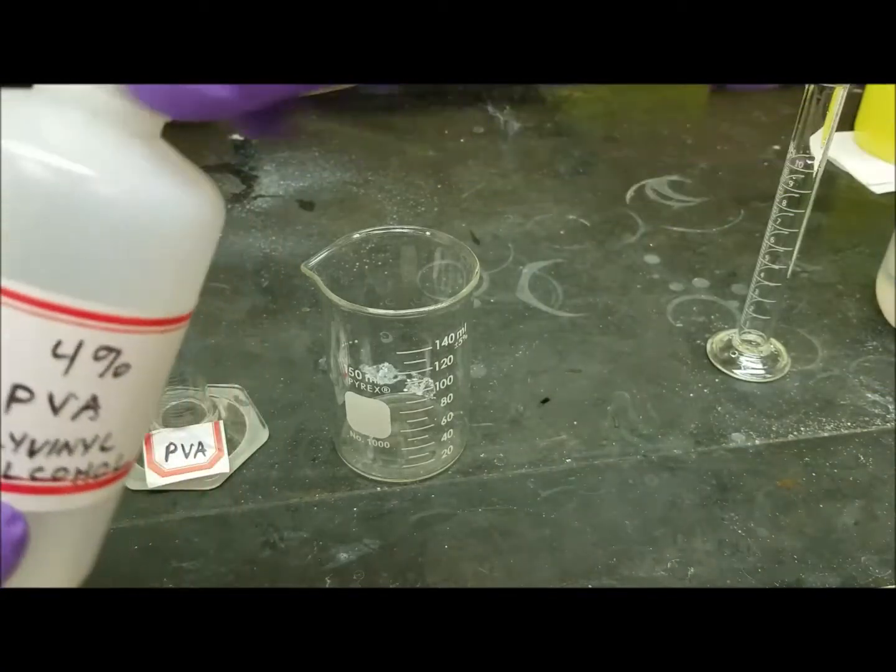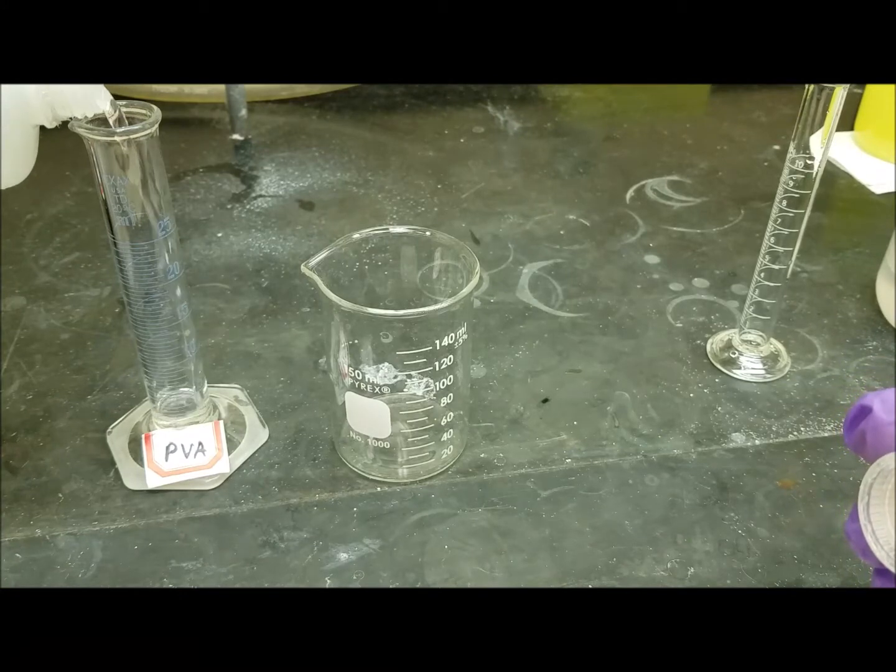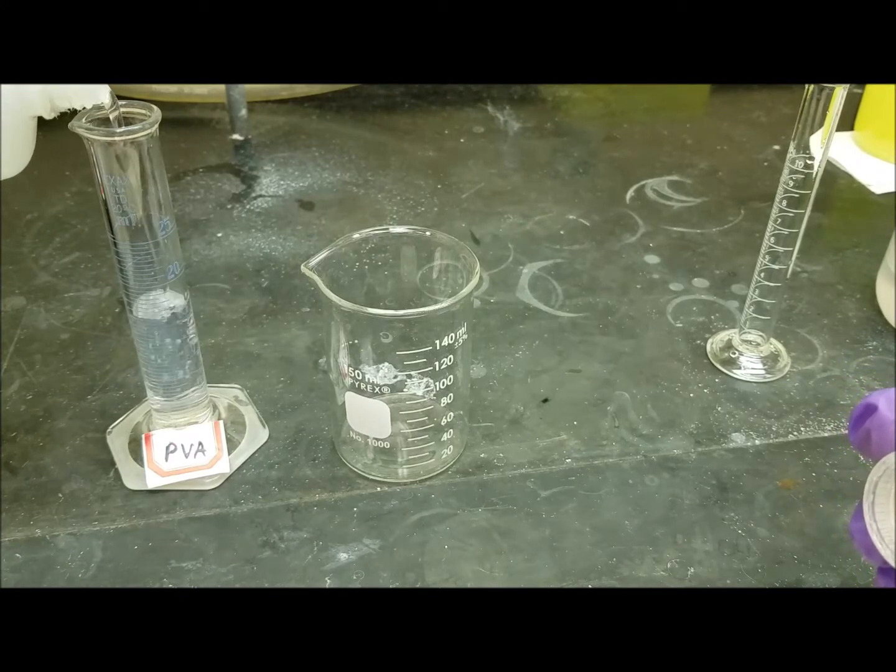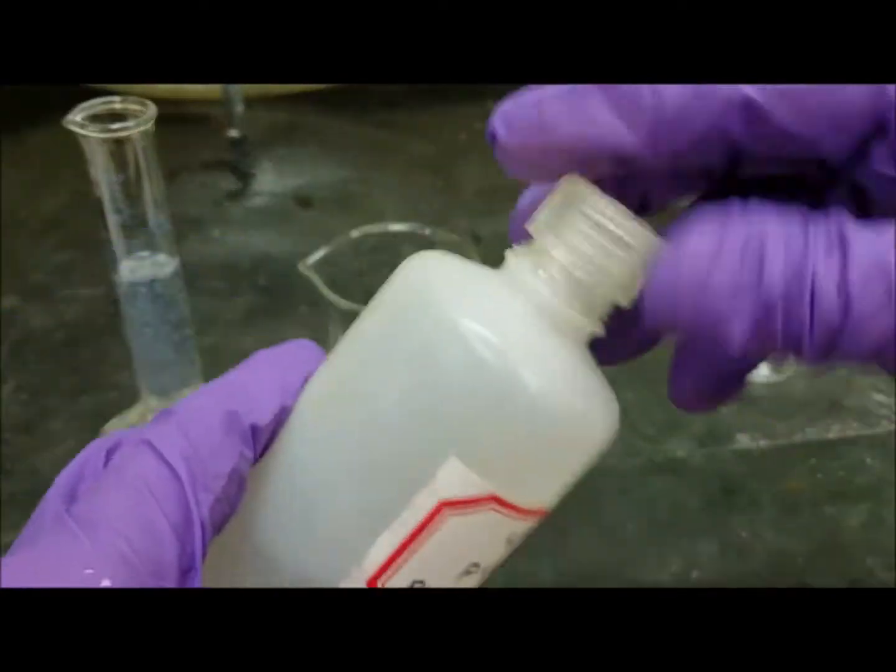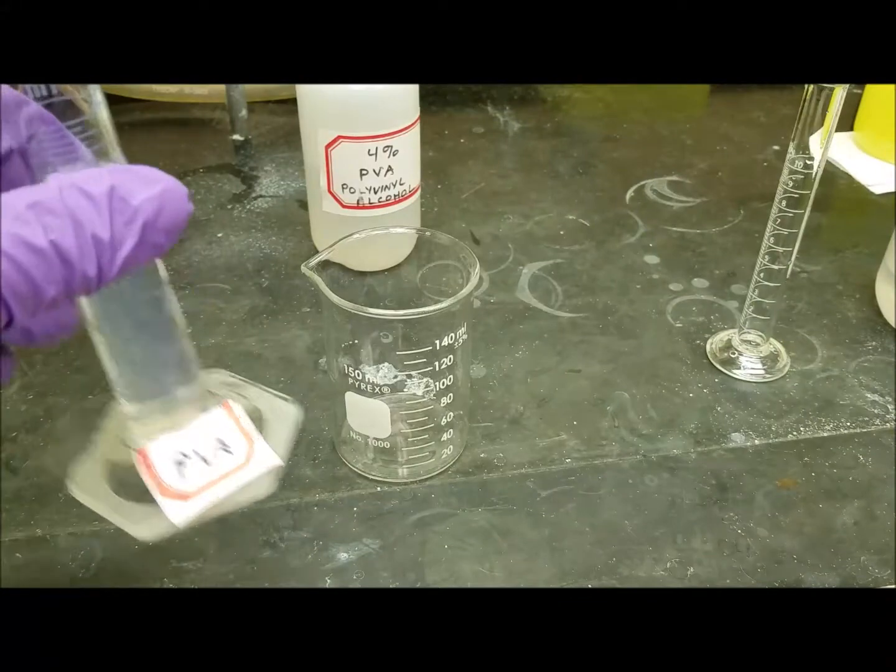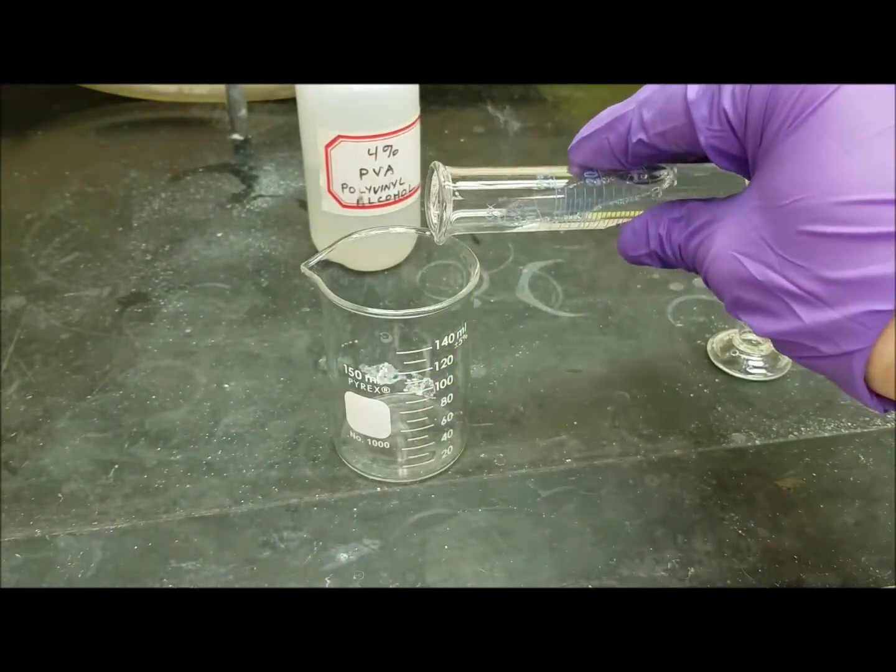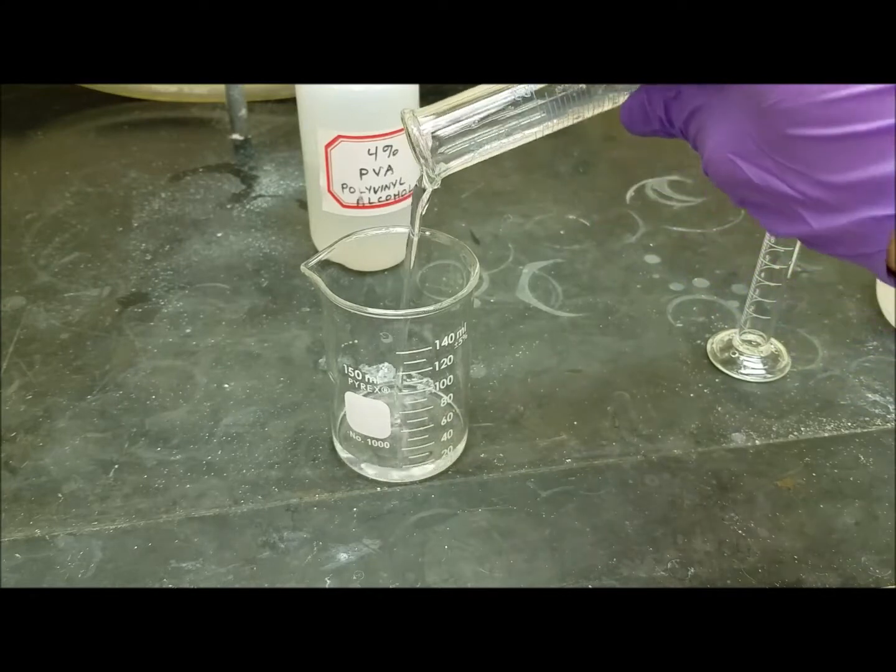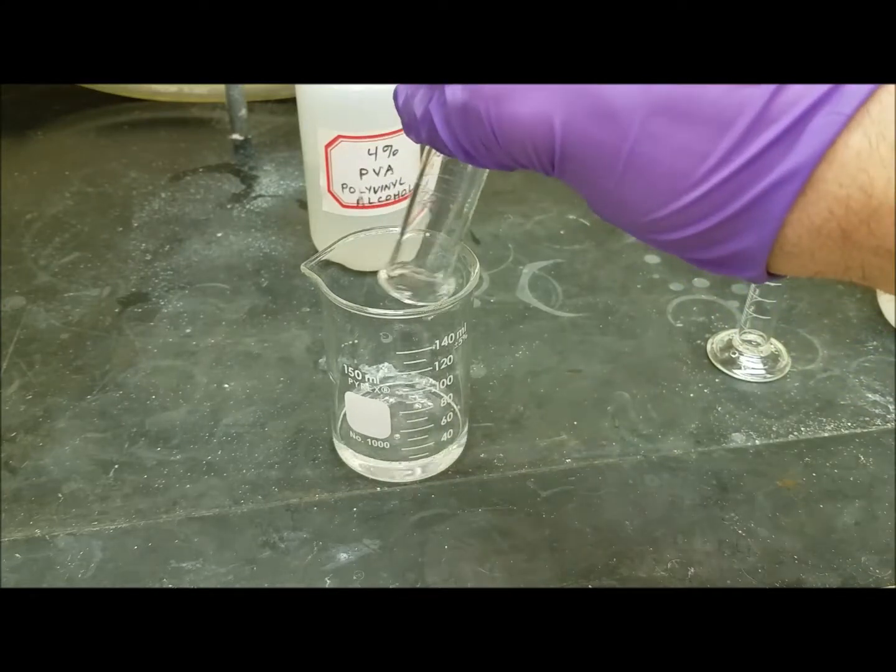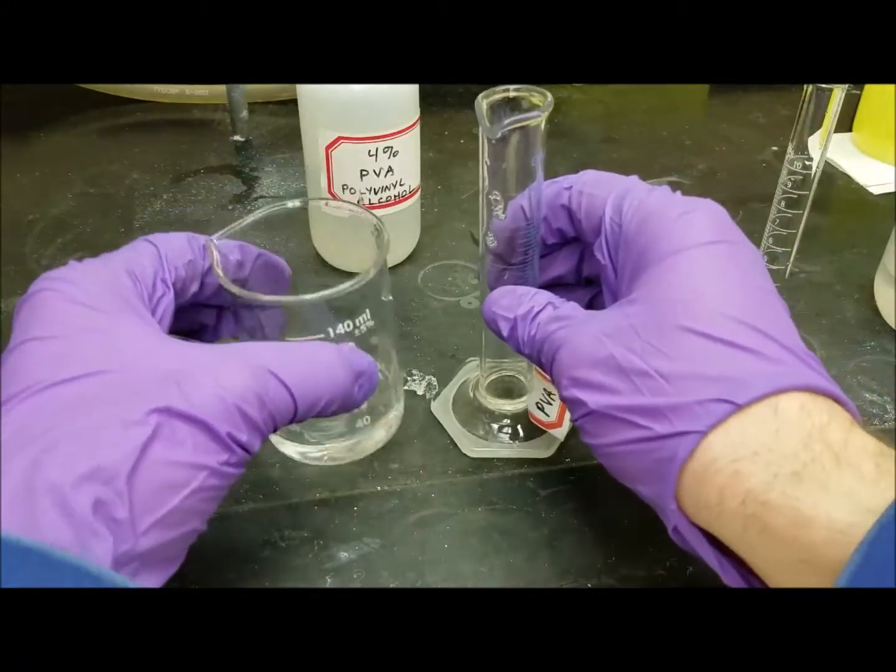So we're going to measure out 20 milliliters of 4% polyvinyl alcohol in water and notice how this is pretty viscous. That's because the polymer is dissolved in there and the polymer makes it pretty viscous, so we pour this down in there, but you notice it is still fluid, even under these circumstances.